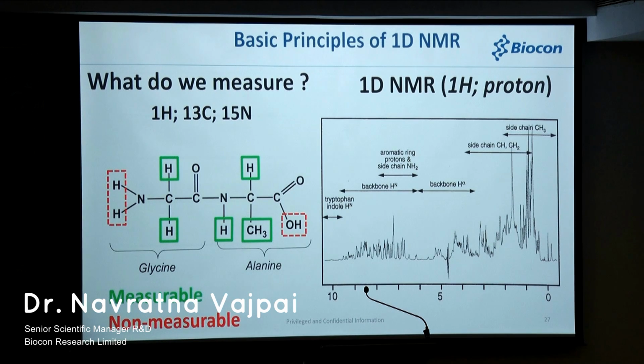Anyway, Ashutosh has covered these things, that NMR actually looks at some of the nuclei, proton, 13C and 15N, typically in a protein. So I am only talking about this. Yes, you can do 19F, 31P, all those other fancy things. But in a protein, you talk about 1H, 13C, 15N, and this is a dipeptide. So basically some of the residues I just showed, this you cannot see because this exchanges, this also exchanges, you don't see. Actually, you can see, but they are broad lines.